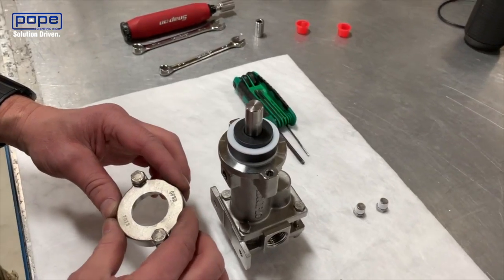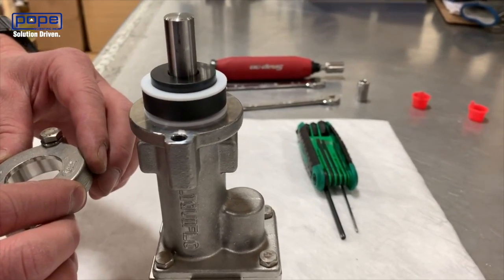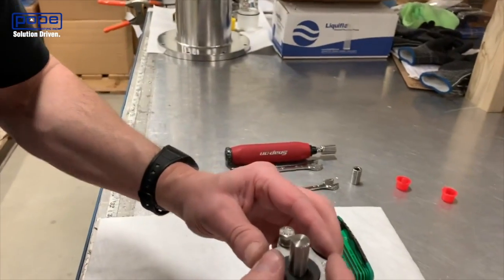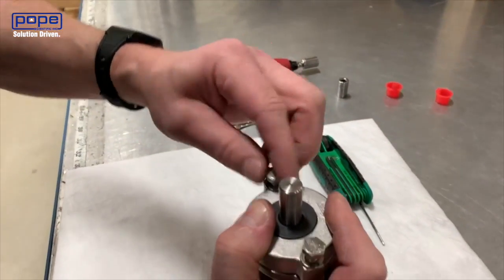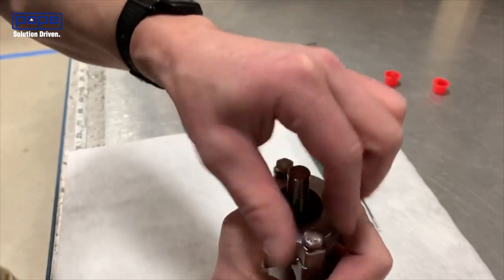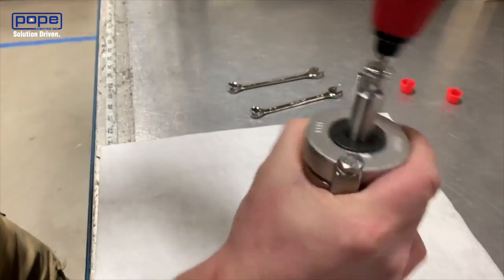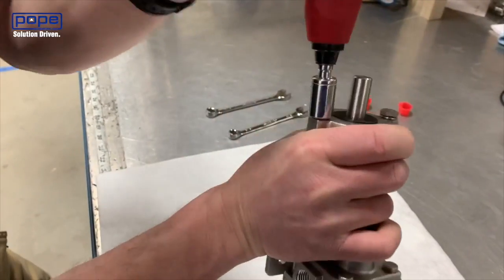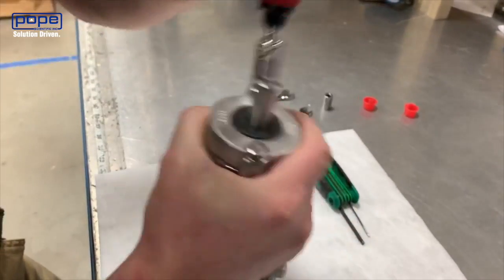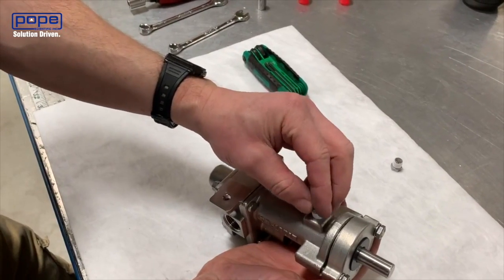Now we've got the seal seat in place with one Teflon gasket on each side. We'll put on the final gland plate and tighten those bolts down. Dave is using a torque wrench set to 40 inch-pounds. If you don't have a gauge, you can just do that about hand-tight.